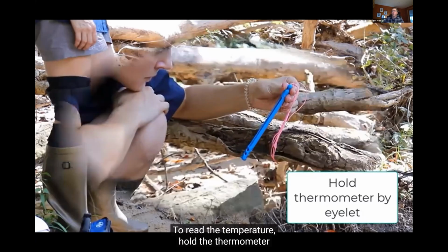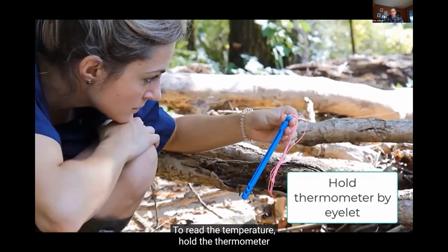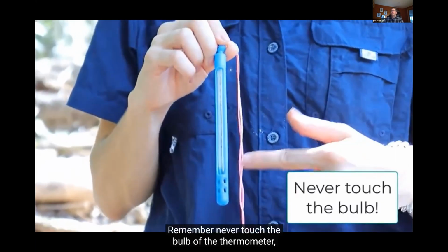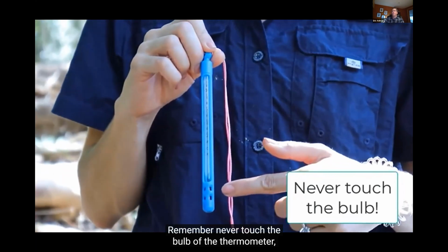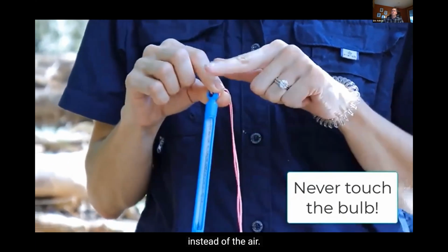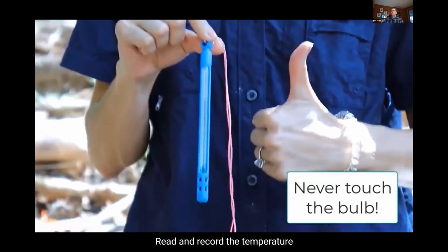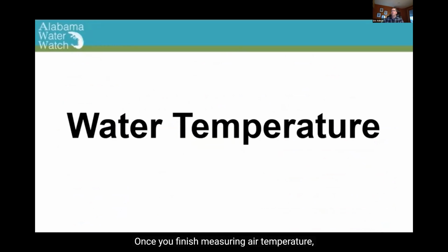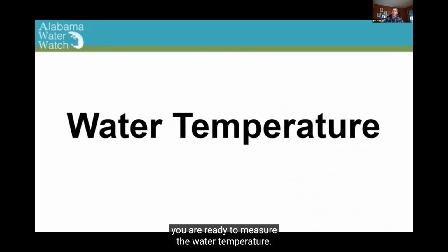To read the temperature, hold the thermometer by the eyelet at eye level. Remember, never touch the bulb of the thermometer, as you will end up measuring your body temperature instead of the air. Read and record the temperature to the nearest ½ degree Celsius on your data form. Once you finish measuring air temperature, you are ready to measure the water temperature.